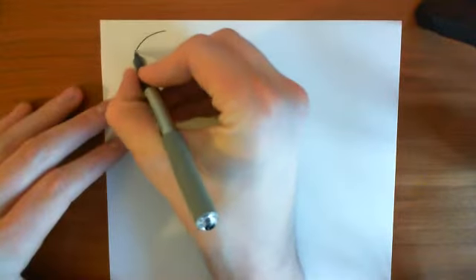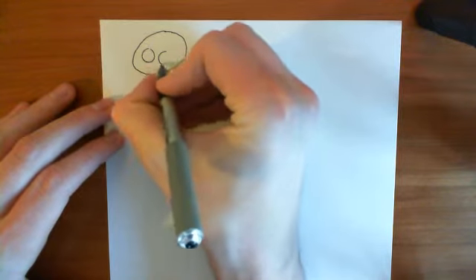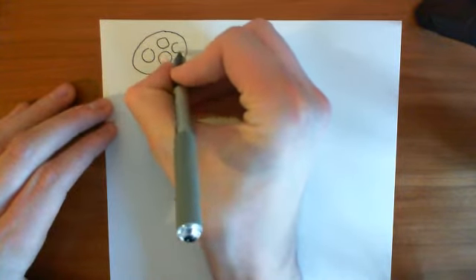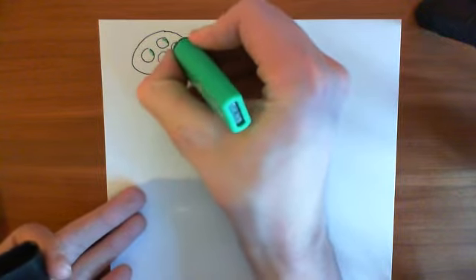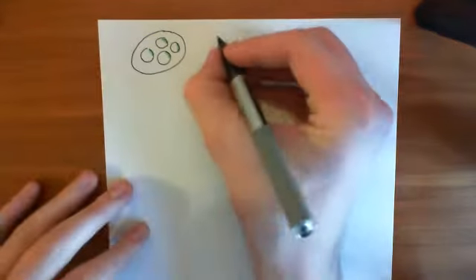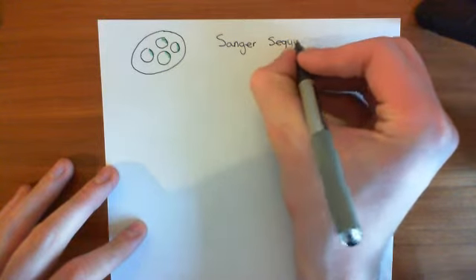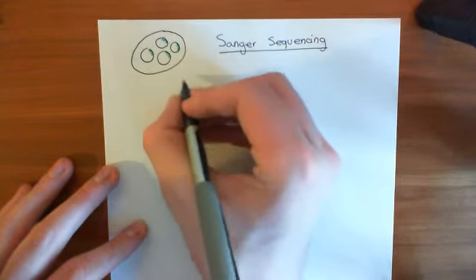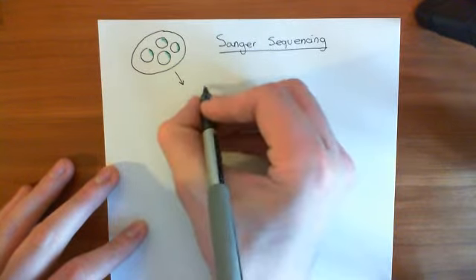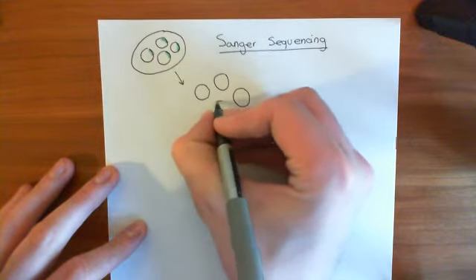Right, okay. So our starting point now is a bacterium which has multiple copies of this plasmid in, which contains one of our fragments from the partial restriction digest. Okay, so these are all utterly identical plasmids. Now, we are going to perform the process known as Sanger or capillary sequencing. So Sanger sequencing is the topic for this video now. Right. And the principle is this. We are going to harvest these plasmids from the bacterium, firstly. So we're going to take all of these plasmids out of the bacterium and separate them off from all of the other goo inside the bacterium. So we've got all of these plasmids outside of the bacterium now.